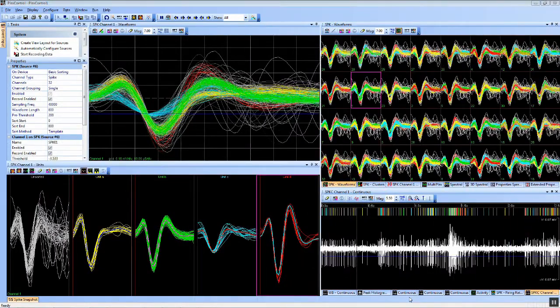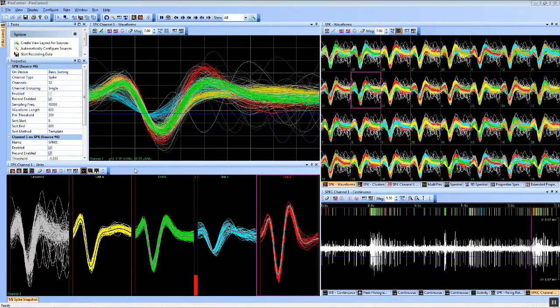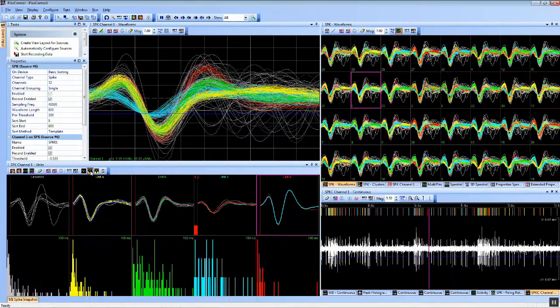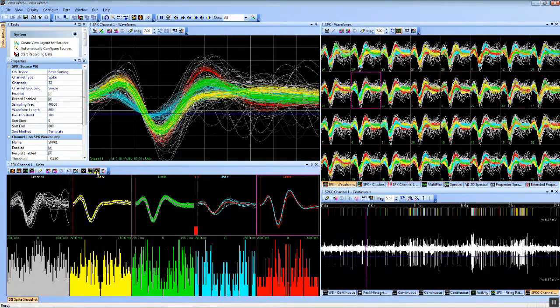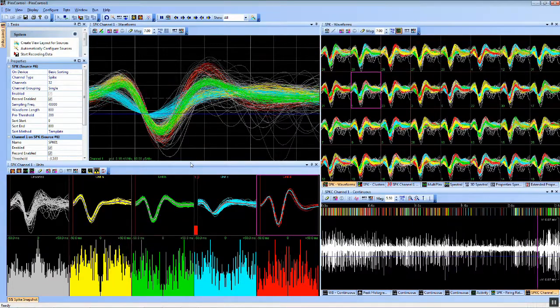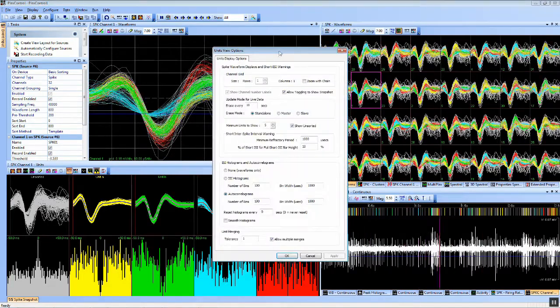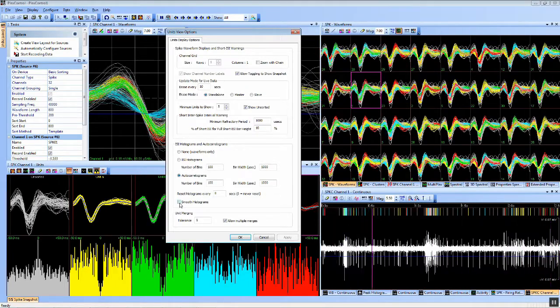The Units view has several new features in Release 17. In addition to the standard display of sorted and unsorted unit waveforms, you can now enable a display of ISI or autocorrelation histograms. These displays are another way to check your sorting. For example, ideally a unit will have a characteristic deep notch in the center of its autocorrelogram. You can adjust the bin size and number of bins for the histograms, set a periodic reset interval if you like, and apply optional smoothing.